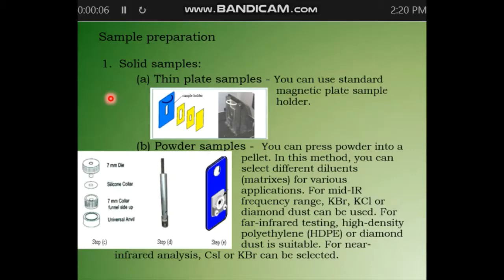You take your sample along with KBr or KCl in the mortar, and grind it to fine powder and assemble the die set as shown in the drawing. When assembling the die, add the powder to the 7 mm collar. Put the die together with the powder into a quick handy press. Press the powder for 2 minutes to form a pellet.